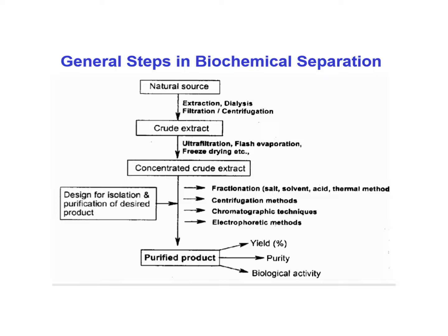Remember, some of the techniques we use require a lot of sample, so sometimes just one cell is not enough. We're talking multiple cells, and so we're assuming that those cells are much alike. But in the back of your mind, remember that things like cancer and tumor cells can be different. But this is just a map here. You have to design a road map, a concept map, an outline for isolation and purification of the organelle, the protein.